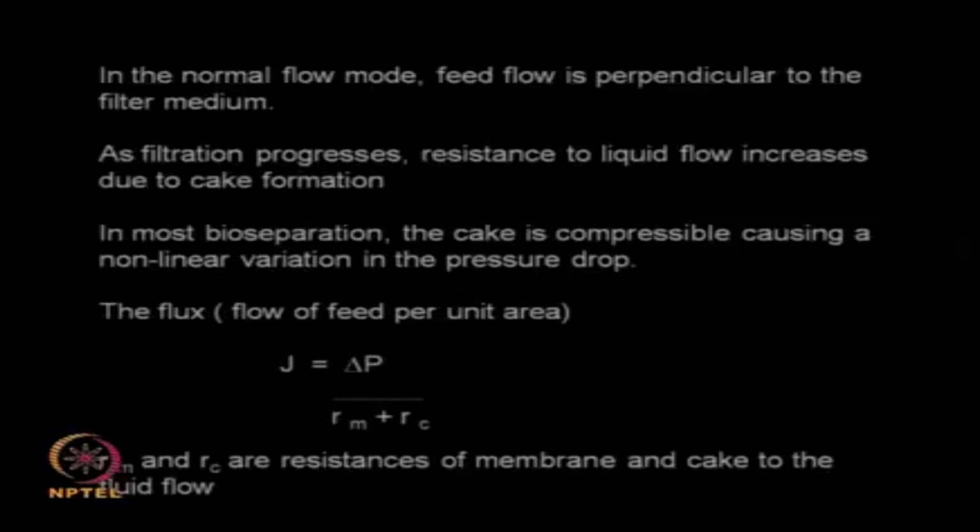In the normal mode, the feed is entering perpendicular to the filter medium. As the filtration progresses you are forming a cake, so the cake formation will decrease your rate of flow. We talked about cake and resistance of the cake long time back. So this is a typical place where those issues will come in.